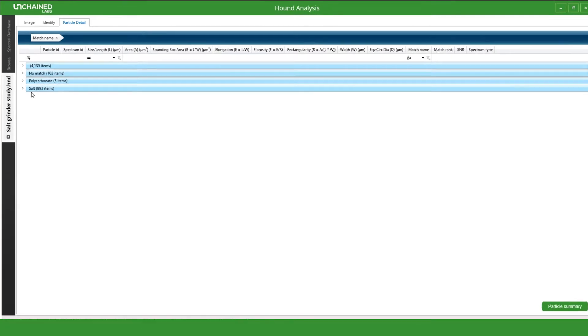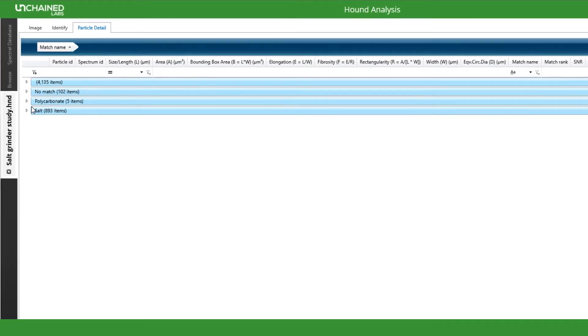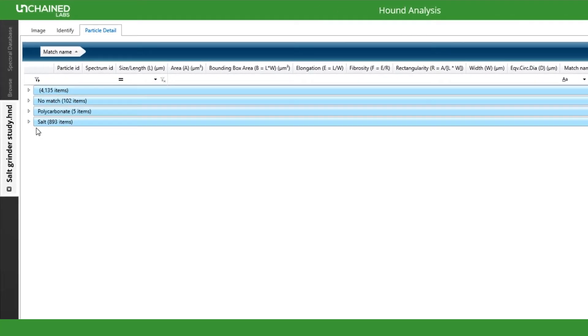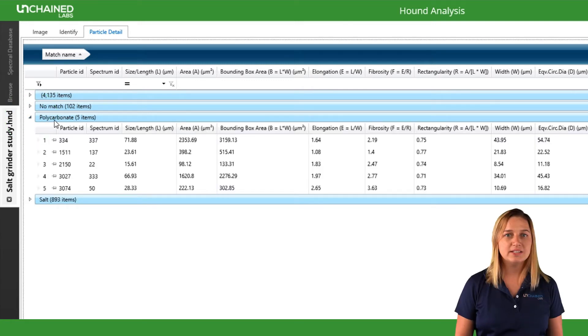Hound is all done and waiting with our answers. Now, thankfully most of the particles are salt, but I want to check on the ones that aren't salt.